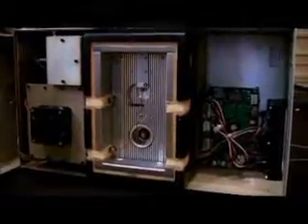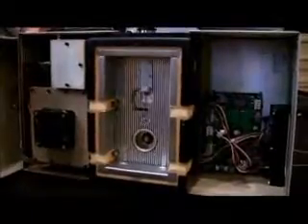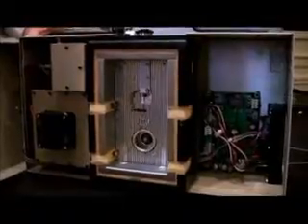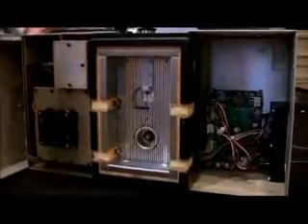Next, we're going to move to actually plumbing the gases and move into the startup operation. But since the oven enclosure, we call this sample processing module, is open, we'd like to point out that as with any gas chromatograph, it's very important to make sure that the system is leak-free. And once the instrument is put together and you have gases fully plumbed, it's a good idea. It's quite handy with the hydrogen as carrier to use a small hydrogen leak detector. They're basically a little thermal conductivity device, and of course hydrogen has a much different thermal conductivity than air.